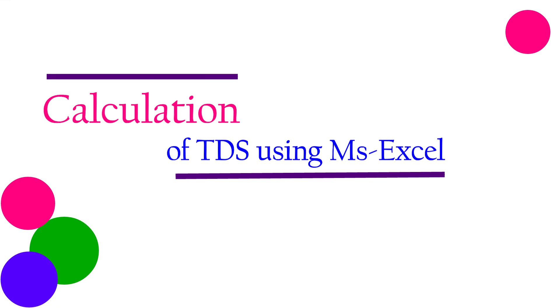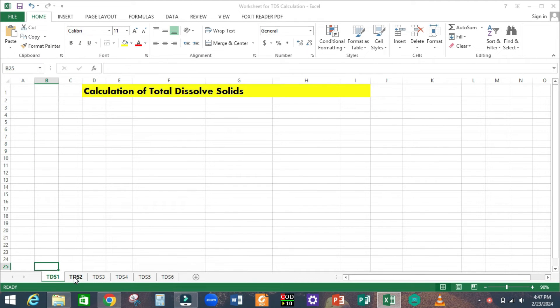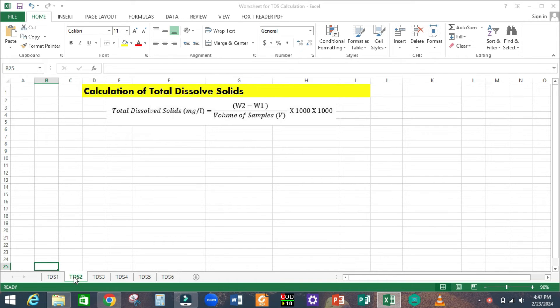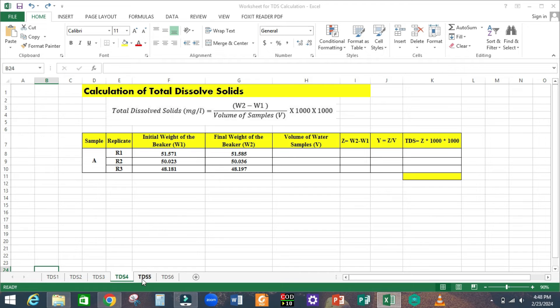Then move on to the calculation of total dissolved solids using Microsoft Excel. Open the Microsoft Excel sheet. As mentioned earlier, TDS equals W2 minus W1, divided by the volume of the samples, multiplied by 1000 into 1000. This is the table for calculating TDS. Enter the measured initial weights of the beakers for R1, R2, and R3, and the final weights of the beakers after the water samples have evaporated. The volume of the samples taken is 100 ml.